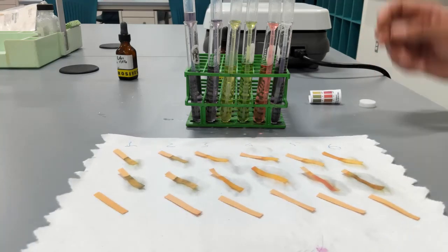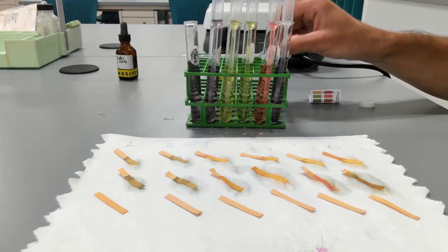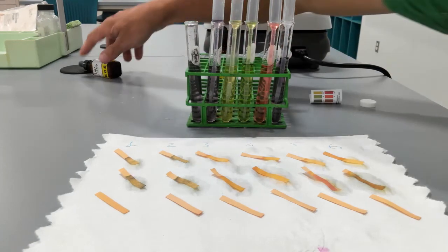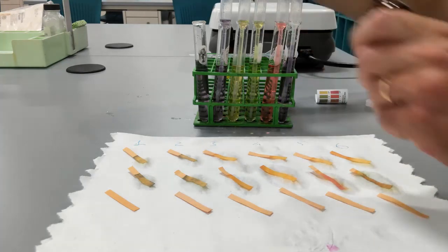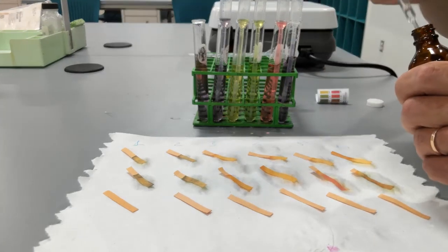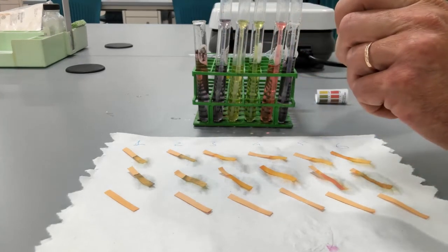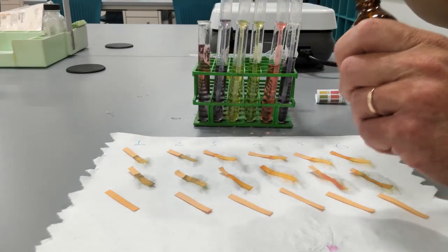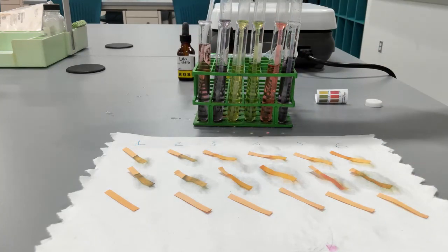Now the very last step would be to add 3 full droppers of acid to test tube 1. One, 2, 3. You see that the color of the tube dramatically changed.